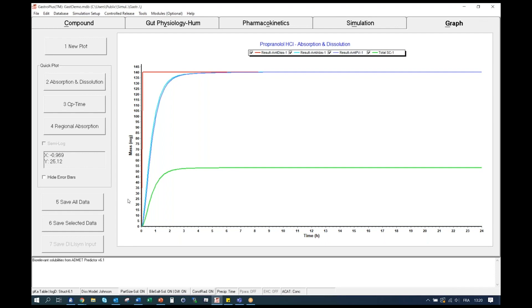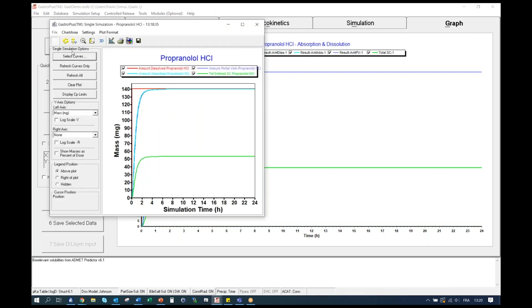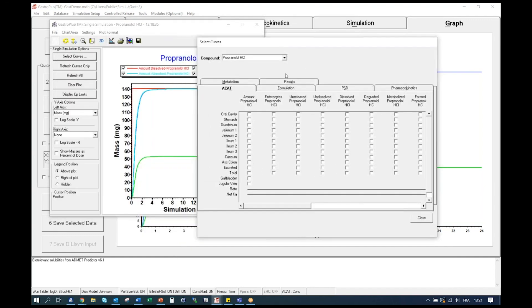For more detail, the user can go to the new plot window and see the details of what is happening to the drug from administration to elimination: how it is moving through the intestine, where it is being dissolved or absorbed, and how it is distributed into the tissues or compartments. You can also see the contribution of different routes of elimination for the given compound. To look at these, you just click on 'select curve' and you have multiple options to choose from.